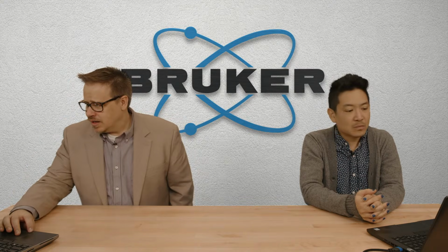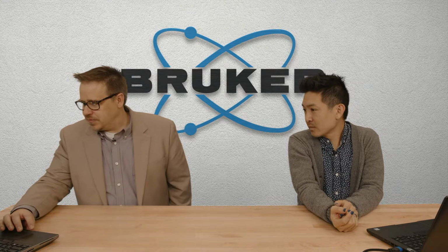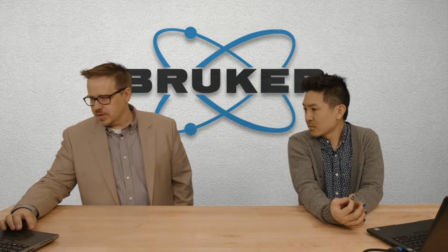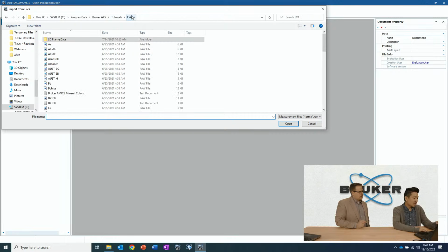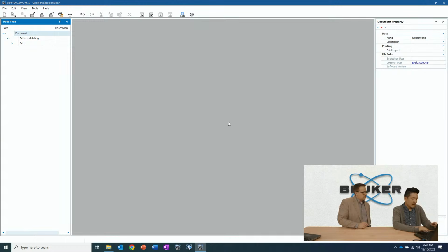First of all, we got a question from Ted: for waterfall and 2D plots, can you show the y-axis as temperature for high and low temperature XRD measurements? If we go back to the screen, the data I was showing was not collected off of a temperature stage, so there was no associated metadata for that. But we do have a data set that has that.